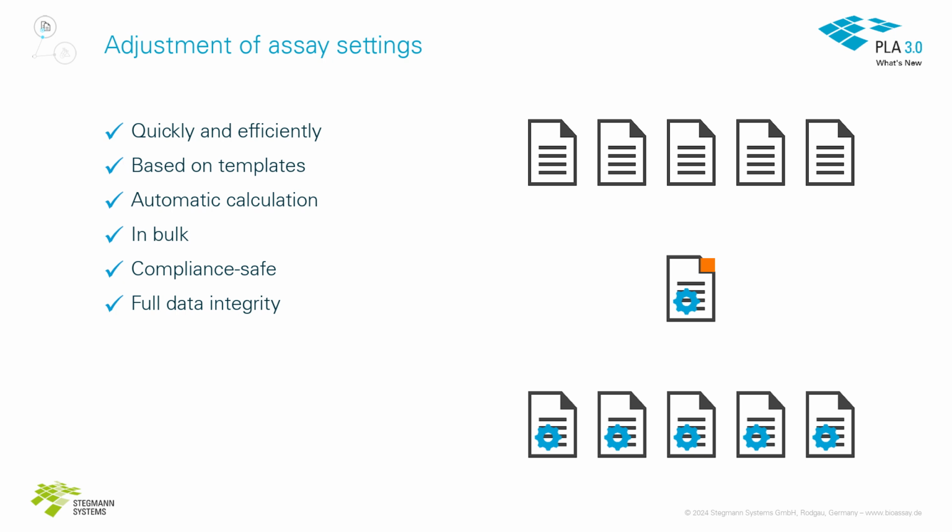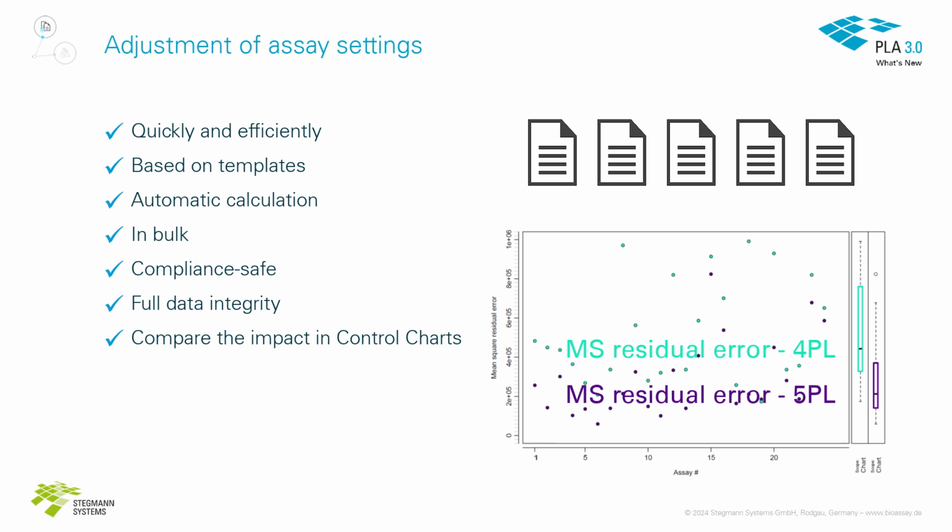The toolkit integrates perfectly with other PLA 3.0 add-ons. For example, use control charts to compare the impact of various changes produced by the toolkit.